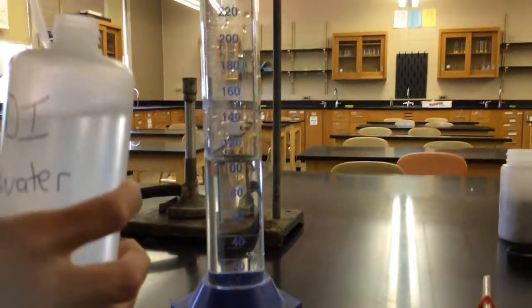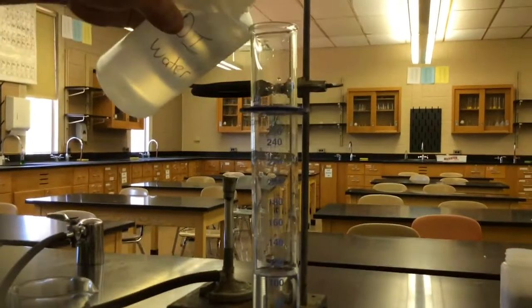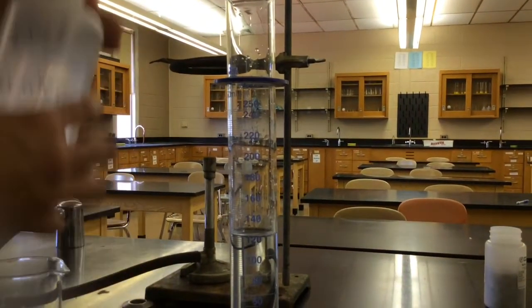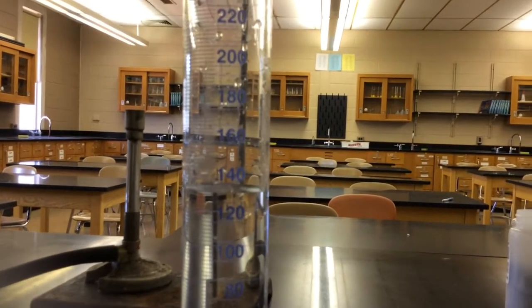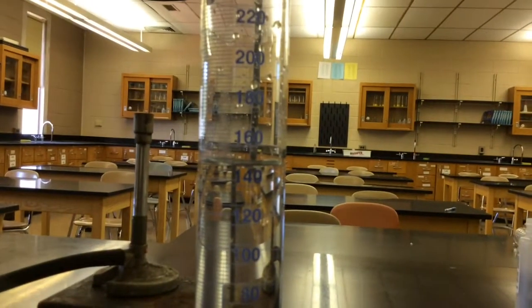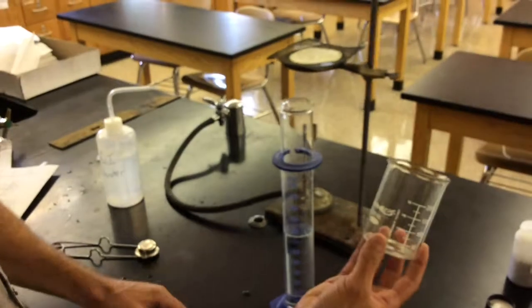And what I would do is take the top off of the DI water and pour it in till it's about 150 milliliters. And then once you get close, put the cap back on and then add the rest. And remember, you measure from the meniscus. So you want to get it to 150 milliliters according to that meniscus. And now once you have that, add that to the 250 milliliter beaker.